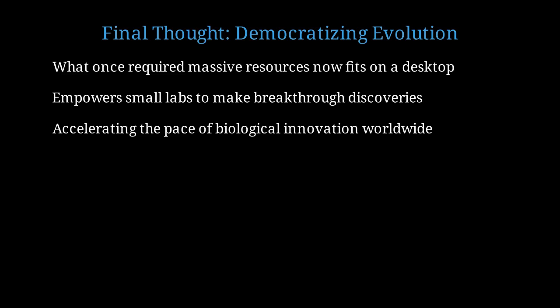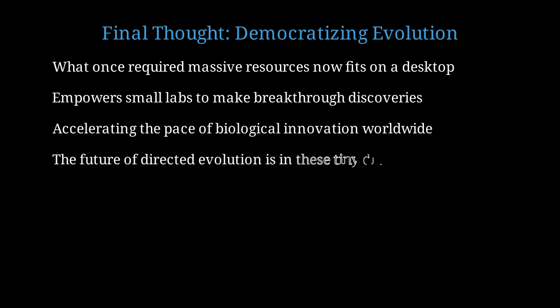The next breakthrough enzyme, therapeutic antibody, or bioremediation organism might come from a small lab using droplet technology. The future of directed evolution is quite literally in these microscopic droplets. Each one is a tiny laboratory where nature's creativity meets human ingenuity to solve some of our most pressing challenges.